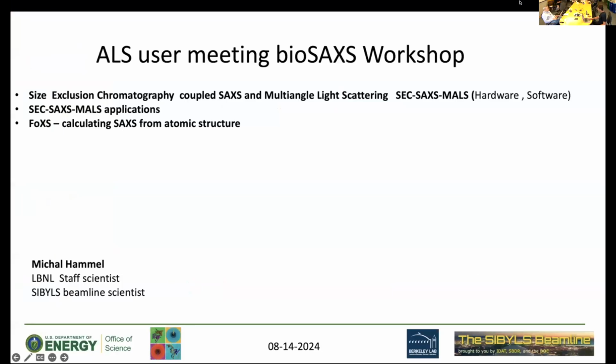I will continue the second half by talking a little bit more about structural biology rather than high throughput SAXS. We're going to mostly focus in the next part on what we can do in the second modality on our beamline, that's the size exclusion coupled small angle scattering.